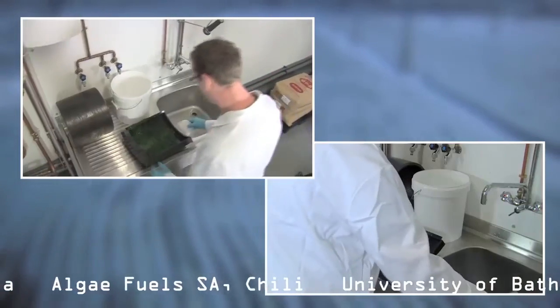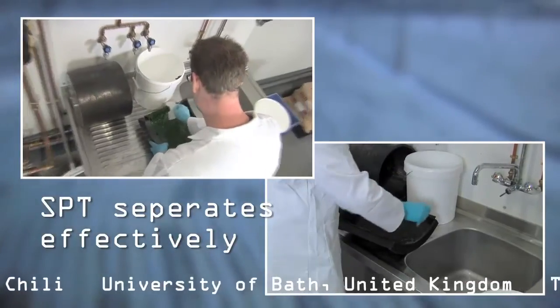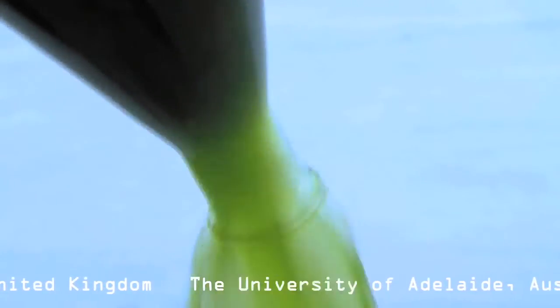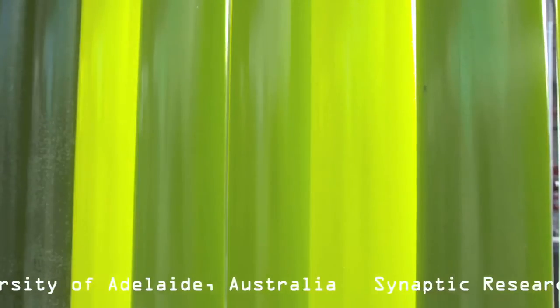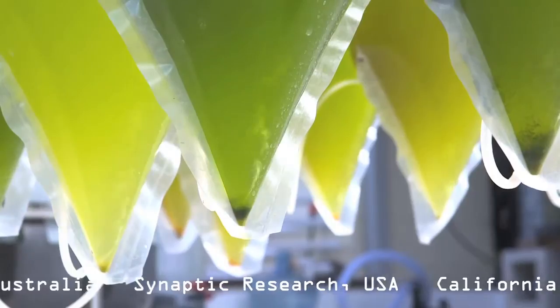And SPT separates effectively. All algae are harvested. The effluent water is clear and free of algae. All algae are harvested alive. There is no shearing, nor are the algae heated up. This guarantees a long shelf life.